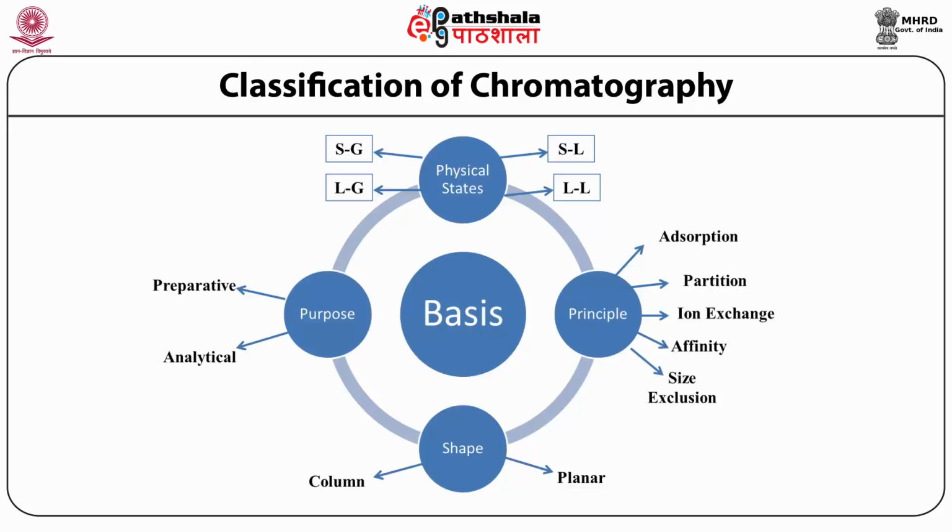Another form is gas-solid chromatography. In this type, the stationary phase, which is an active solid adsorbent in powdered form, is filled in a tube. An inert gas like helium is used as a mobile phase or carrier gas.